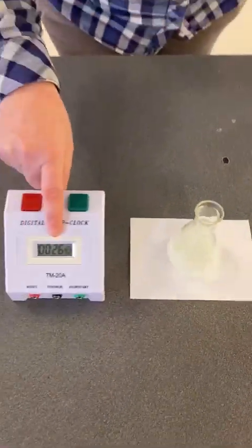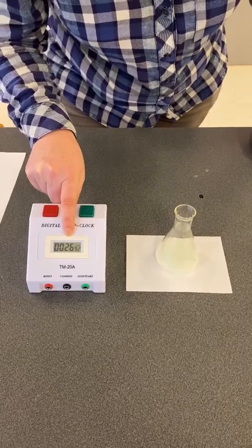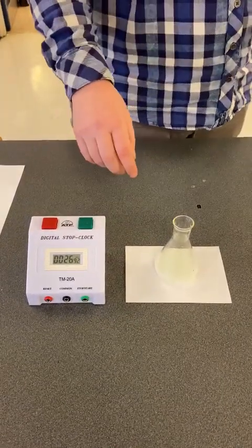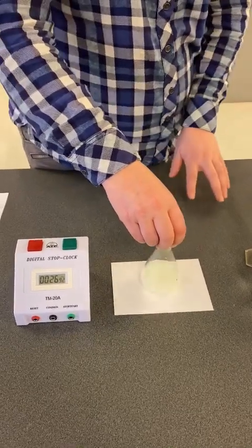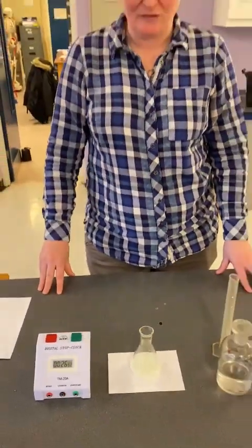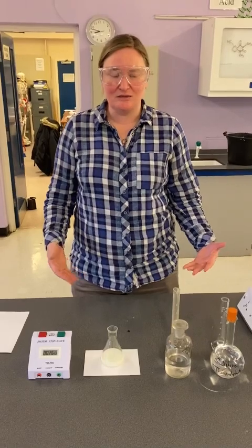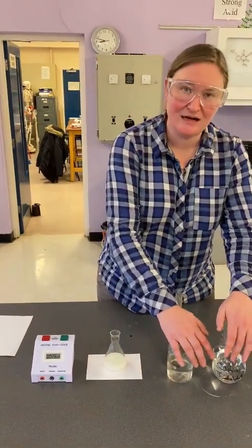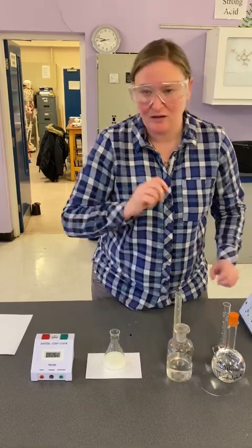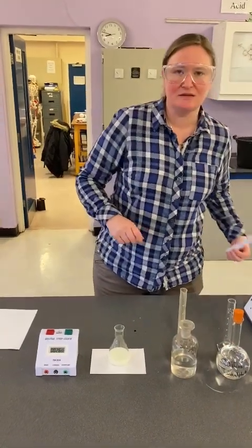Okay, let's have a look. We've got 26 seconds. So that took 26 seconds for the reaction to produce a solid that will make the cross disappear. Now we're going to repeat this experiment, but this time we're going to use sodium thiosulfate and hydrochloric acid at different temperatures. But before we do that, we're going to need a results table.